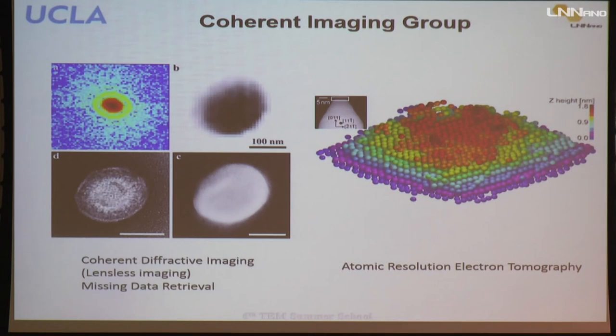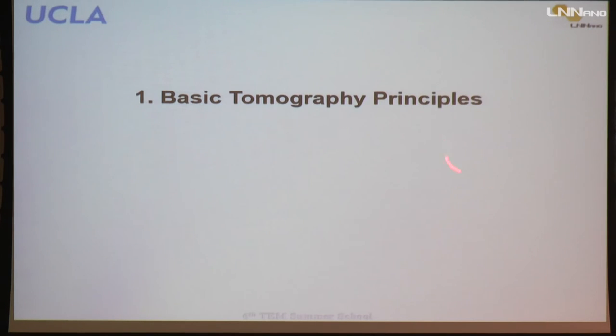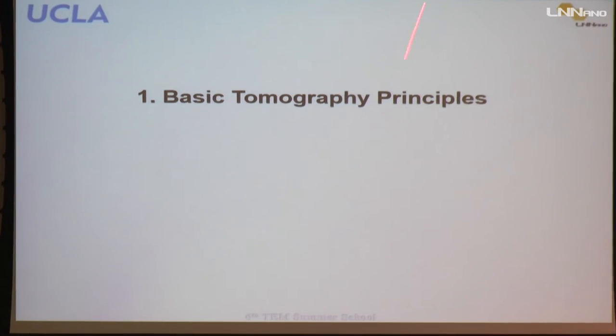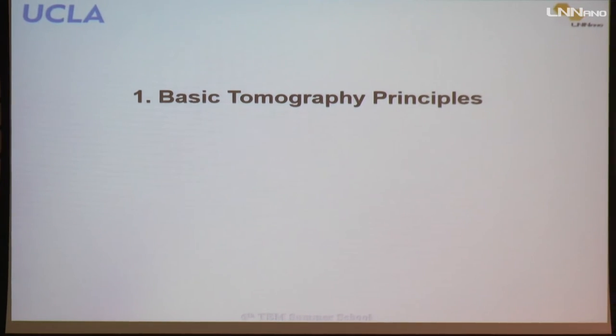For my talk today, I will talk about the basic tomography principles. This is just basic tomography. The principle works for every tomography, like CT, computed tomography, or MRI, all kinds of different tomography work on the same principle. After introducing these principles, I will introduce something more focused on electron tomography. More specific electron tomography will be later in today's session, and tomorrow I will introduce some more recent work about our atomic resolution 3D electron tomography.